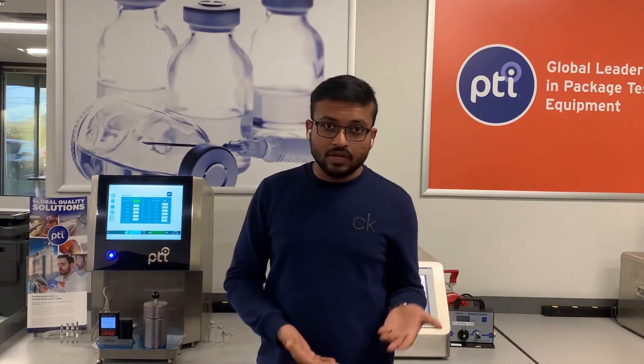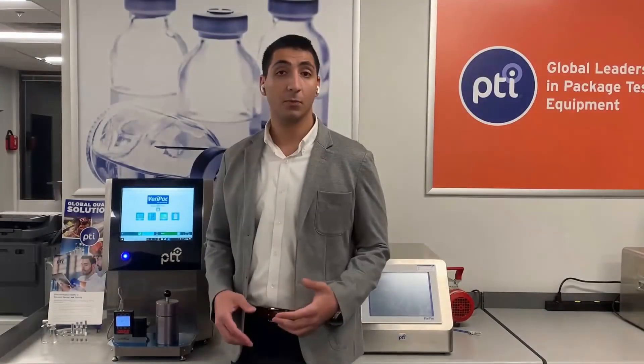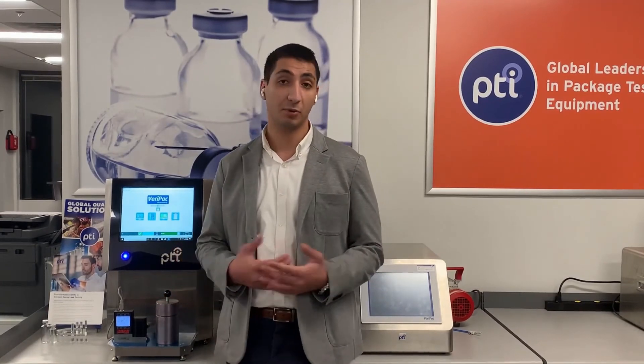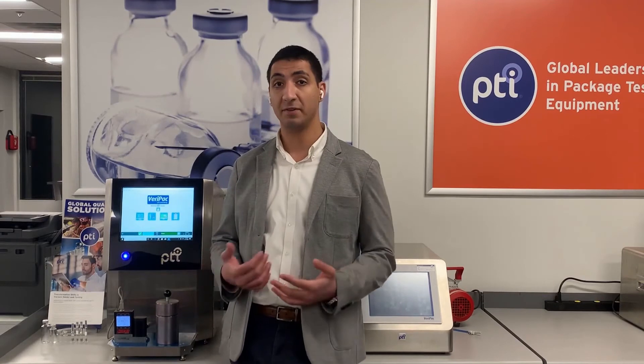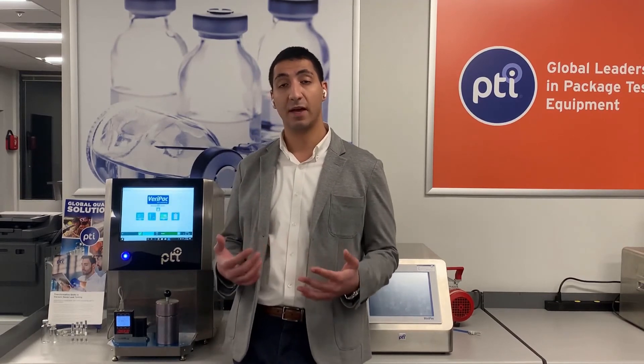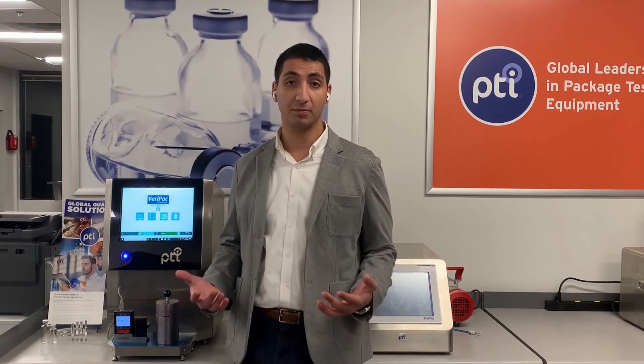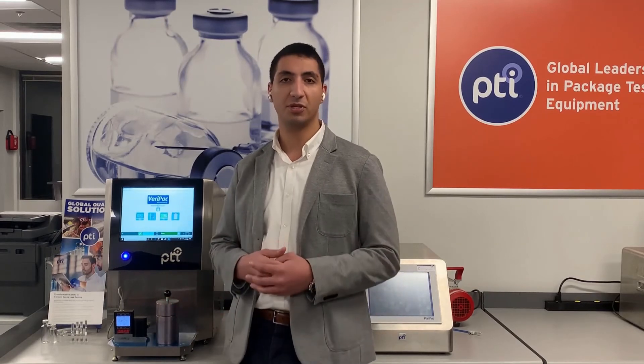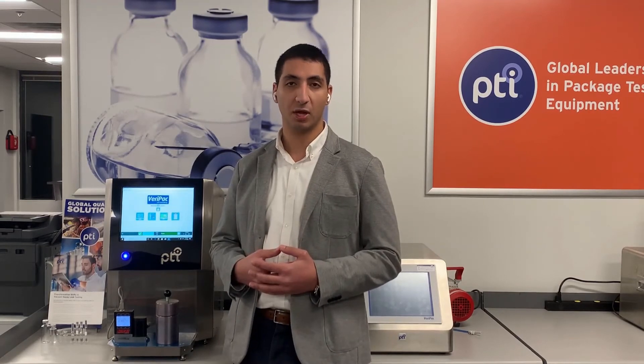With that, I would like to conclude my presentation and pass it over to my colleague, Nobi. The VeriPac 465's impressive capabilities and innovative features truly make it the best vacuum-based leak detection system on the market. I'd like to thank you all for your attention. Should you have any questions, or would just like to learn more, please don't hesitate to reach out to us directly, so we can show you firsthand why PTI can provide the most reliable and the most sensitive solution for your needs.